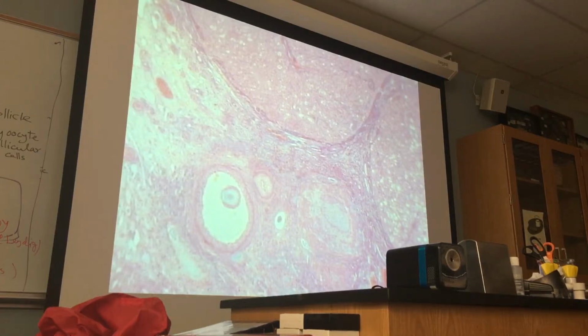So is the big thing a secondary oocyte? Which one? That one? No, this is a primary oocyte. For sure. Definitely, this is not a very large follicle. This is a secondary follicle, this big thing. But this one is the primary oocyte. This is the gamete, the potential female gamete. But it is protected by, or surrounded by, granulosa cells forming the corona radiata. You got that? Okay.